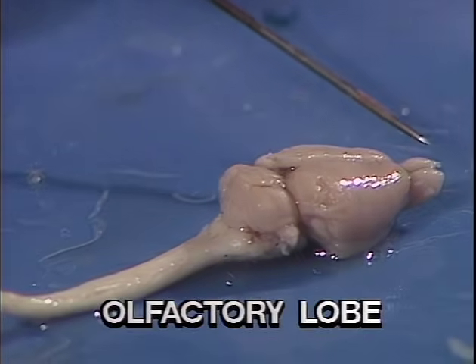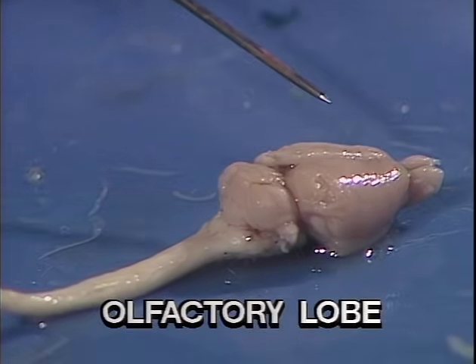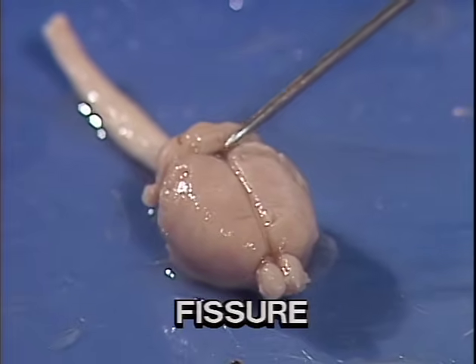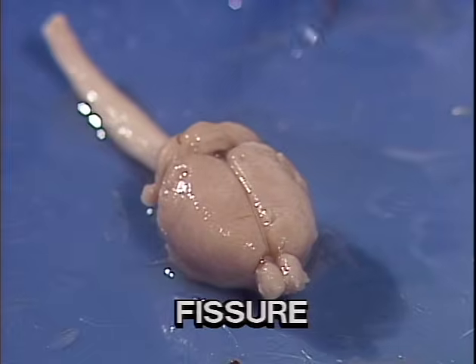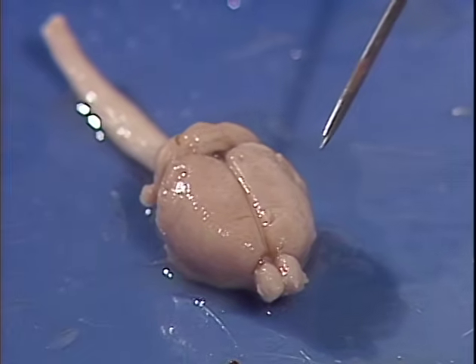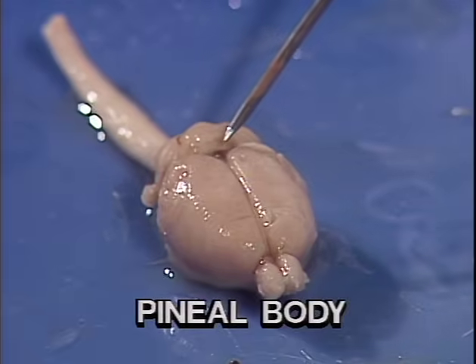This is the olfactory lobe. Caudal to it is the cerebrum. It is divided by a deep cerebral fissure. It divides the cerebrum into a left hemisphere and a right hemisphere. Here we have the pineal body.